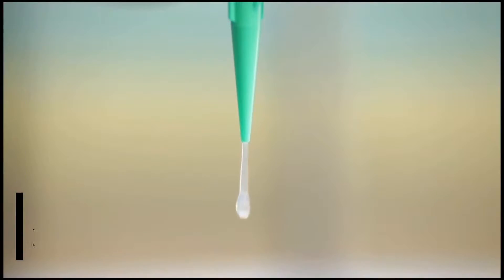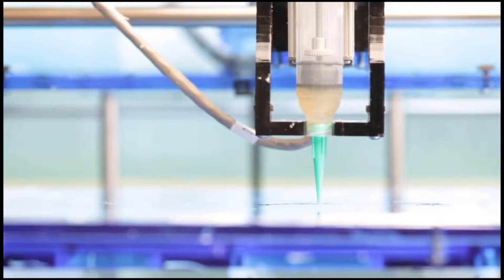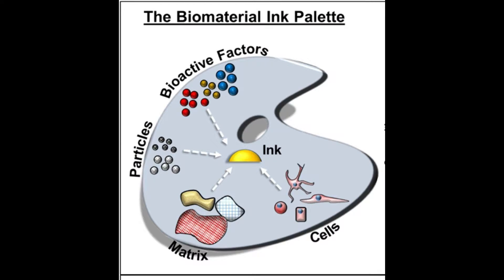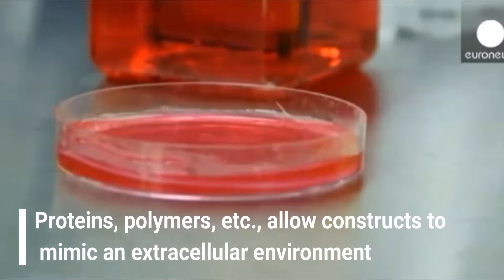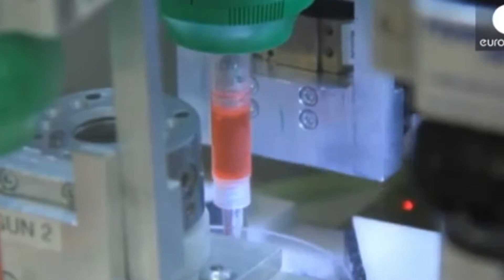The next requirement is called bioink. This is a material made from living cells that behaves much like a liquid, allowing people to print it in order to create the desired shape. Also contained within the bioink are materials such as proteins, polymers, gelatin, hydrogel, and collagen, among others. These materials allow the printed constructs to mimic an extracellular environment to support the adhesion, rapid reproduction, and differentiation of living cells. The ink is filled into a cartridge and inserted into the bioprinter.